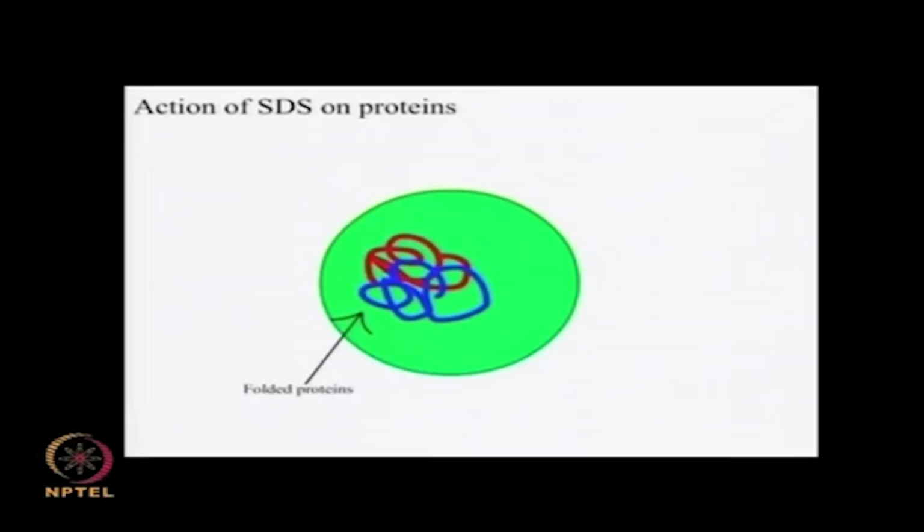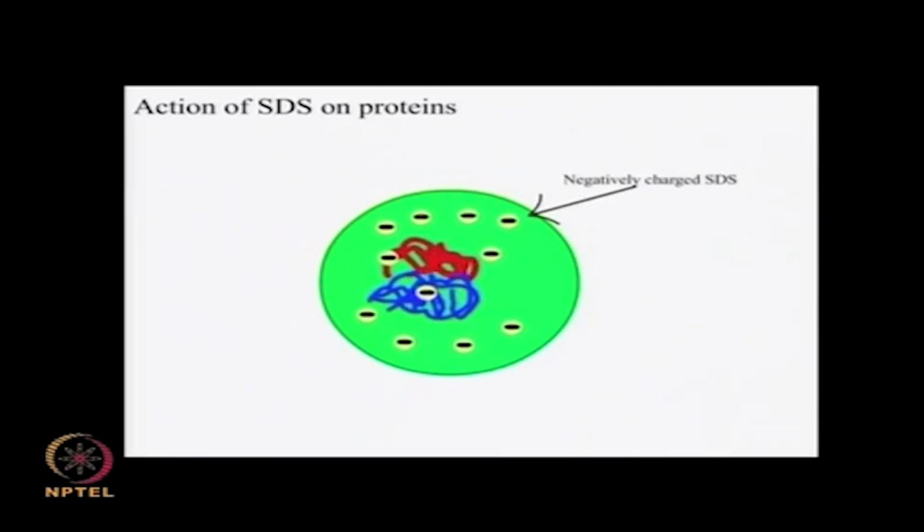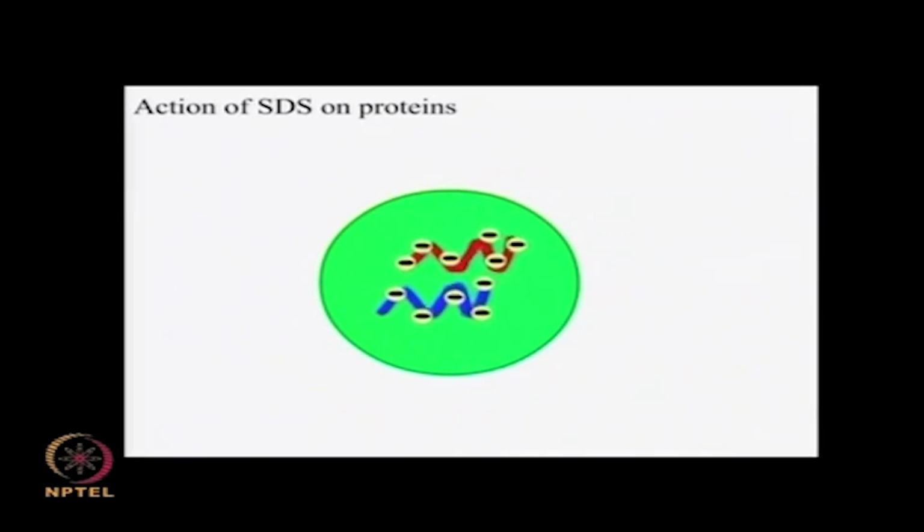All the proteins present on the IPG strip carry a large negative charge due to the action of SDS, which denatures the protein and binds to the polypeptide backbone at a constant weight ratio. This ensures that the proteins get separated exclusively on the basis of their molecular weights rather than their mass to charge ratios as in a native PAGE.